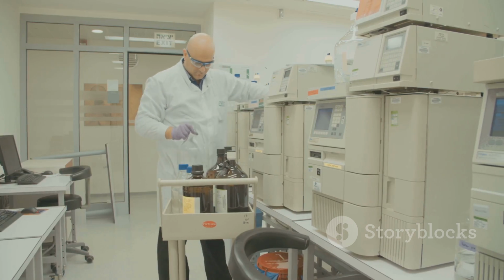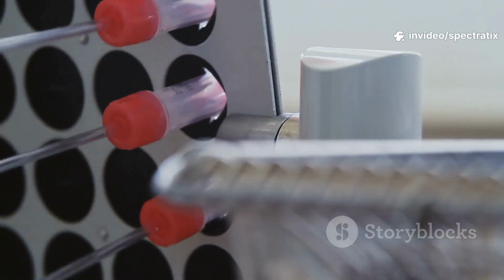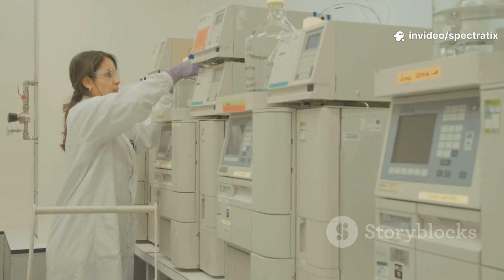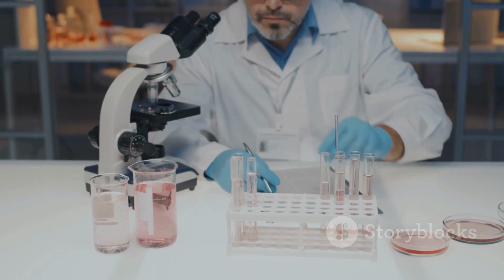So next time you run a GC sample, take a moment to appreciate the complexity behind those clean, sharp peaks. It's a technique that's been refined for decades, and it's still one of the best tools for separating and analyzing volatile compounds.